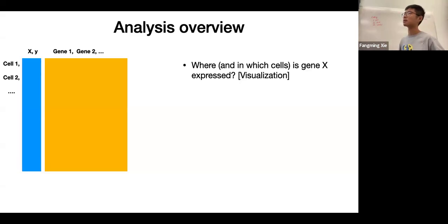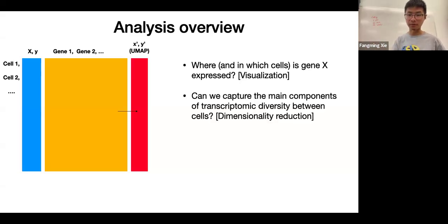That's a visualization problem. Just make a plot. You measured many genes in all these different cells, and each cell has a location. Can we treat it as a staining method if you're interested in the expression distribution within the space for a particular gene? Can you make a plot about that from the table? Once you can do that, you can do it for all of the genes in the data.